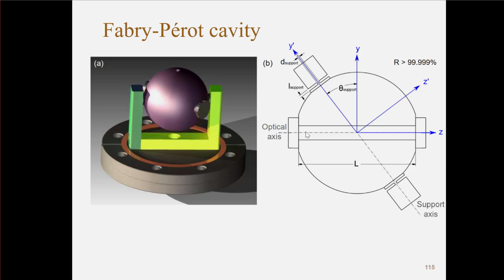And then you measure the distance between these two mirrors. You have formed a Fabry-Perot cavity between these two mirrors, and you measure the distance between them very precisely. In our lab, where I work, we have a laser which is stabilized to such a cavity, and the precision of how long this cavity is on short timescales, like a second, is less than the radius of a proton. So you can actually do this.